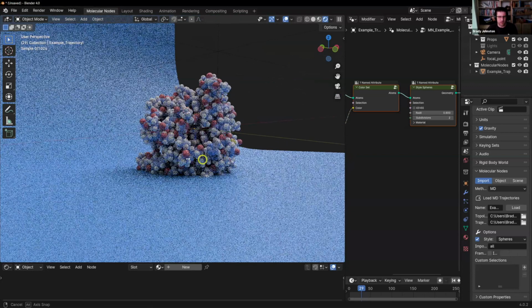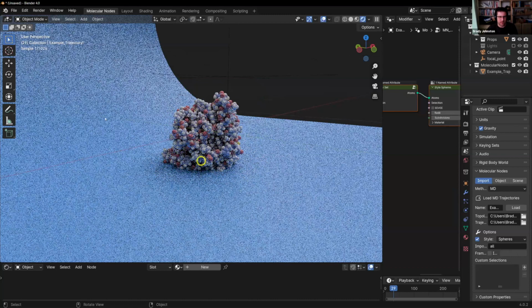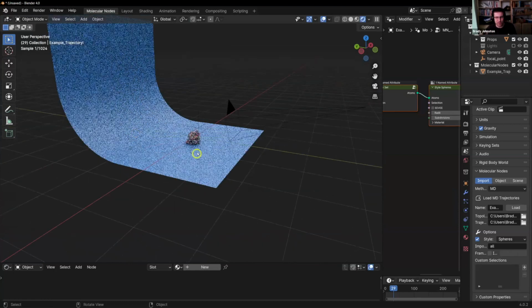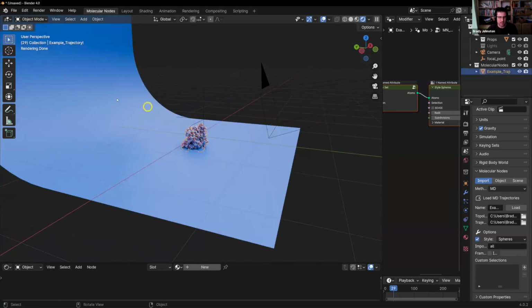What I will do first is fix this. While we're looking in this big 3D scene, I might zoom out a bit. We can see by default, it comes with this big backdrop. If you've done any photography, you might recognize something that looks like this. So we're basically taking some beautiful portraits of our molecules. We can left click to select things.